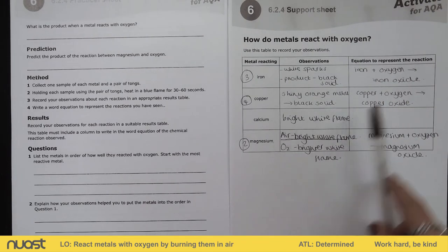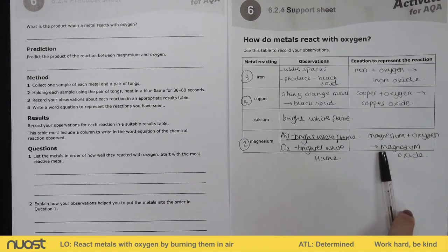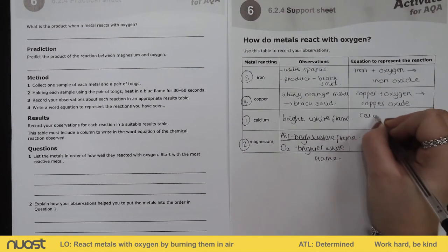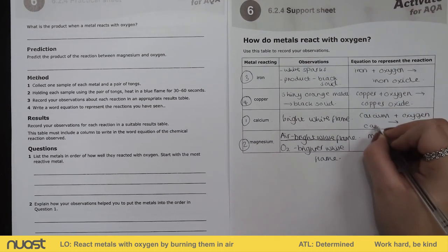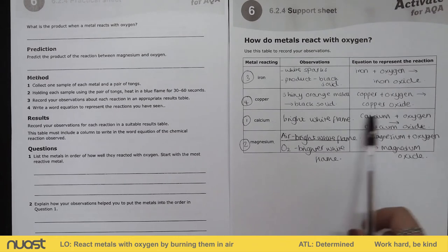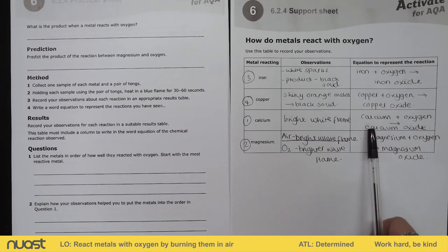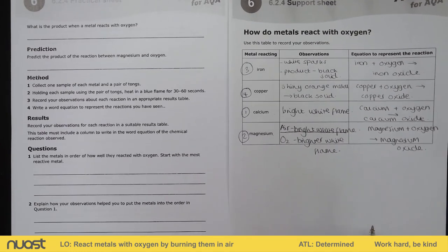So again, pause the video, try and write your word equation for when calcium reacts with oxygen. Okay, you've got three to look at so far, so you should be able to do that one now. So pause the video and then we'll see if we get the same answer. Okay, so calcium plus oxygen goes to calcium oxide, okay? And unfortunately for us, that calcium oxide has been made so quickly, just from me opening that sample of calcium that we had in school, okay, that our calcium oxide had been made and that's quite hard to remove even when we're putting it into the Bunsen burner.